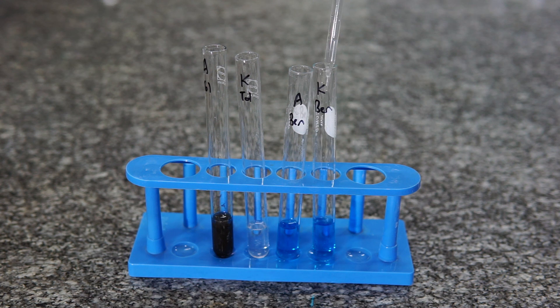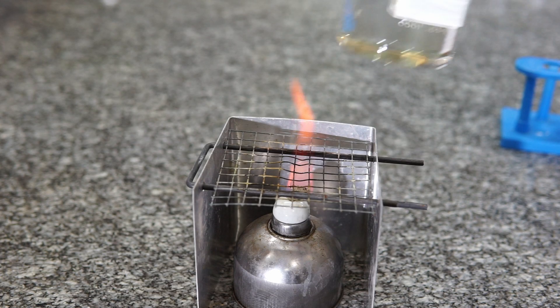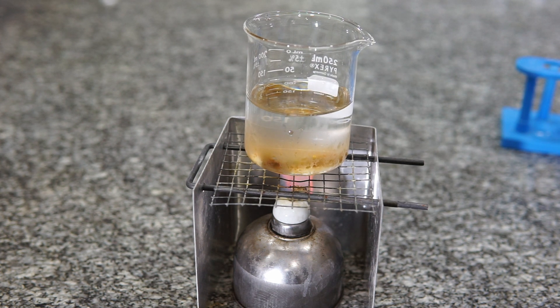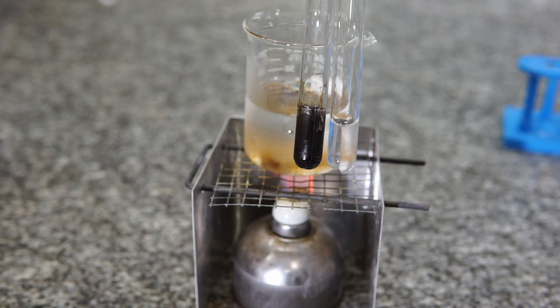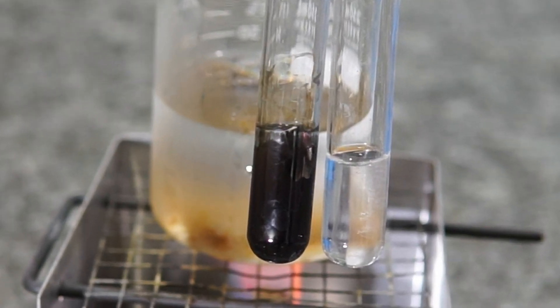And again to the Benedict solution, still no reaction. Next up we need to heat the samples. We did get a reaction already in the Tollens reagent, but the heating will allow it to develop further and also allow the Benedict solution to react if... you look here at this close-up, we can see we've got a silver tinge already appearing.